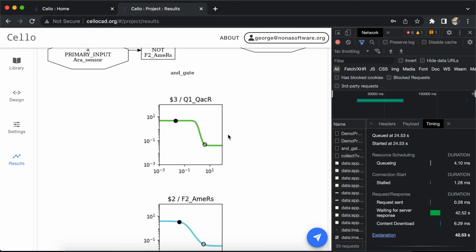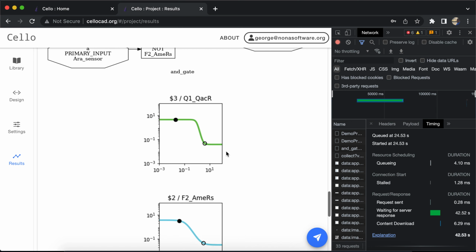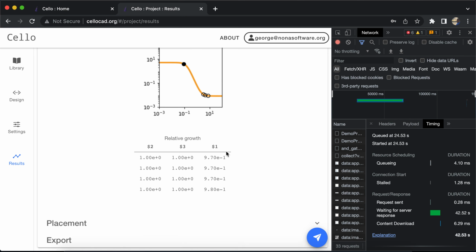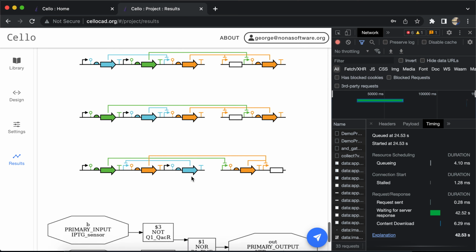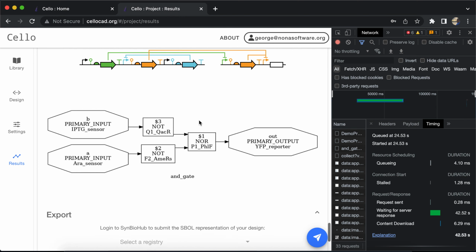As we go down into this last portion, what this table is representing is a bit of the response plots, where the filled in circle means that the promoter is present, and the empty circle means the promoter is not present. Just so you're able to read these diagrams, and we're going to go deeper as we go into placement. Like I told you before, these placements are all synonymous from the very top. They can all be utilized, and some might be more effective than others.